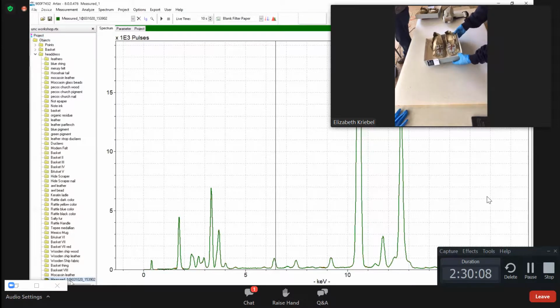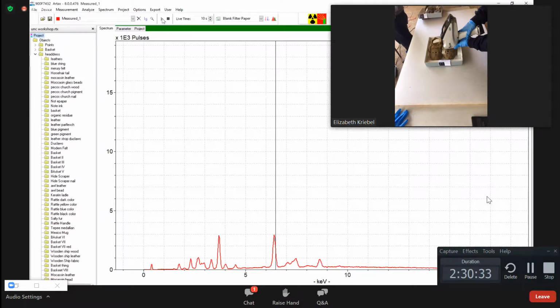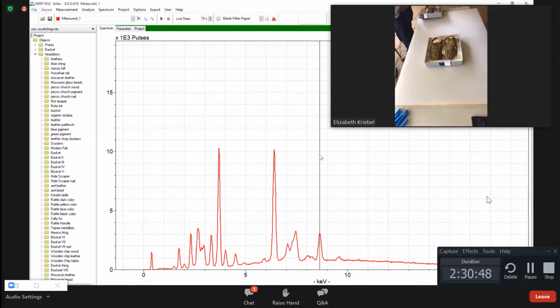Hematite is iron. I mean, it might not be appropriate to call it hematite if it's in the glass, but you know, iron based. All right, I am ready. Starting. Got it. So a little bit of salt, no bromine, a lot of zinc though. So that's more modern, relatively speaking. Whatever this is, it's after contact. Okay, so the zinc is the tell.